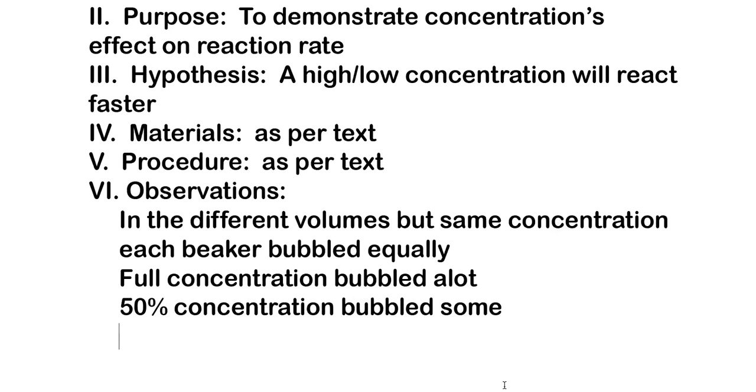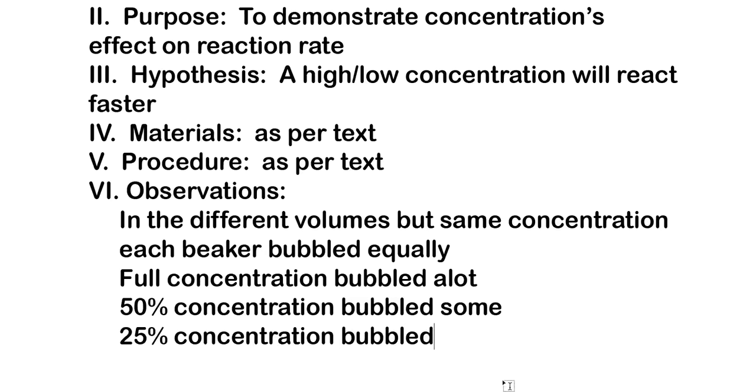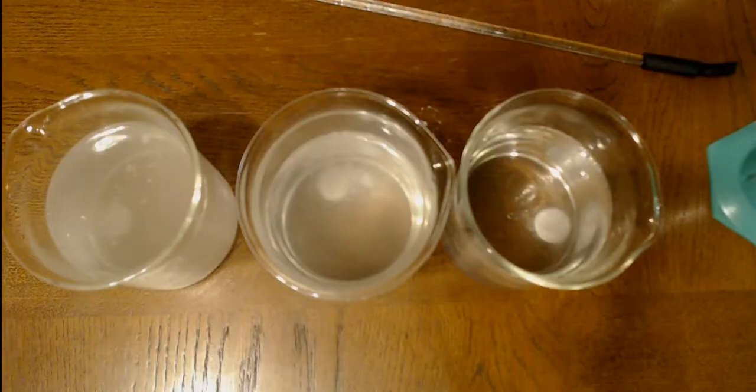Then 25% concentration, bubbled a little. Okay, let's go back and look at our things here.